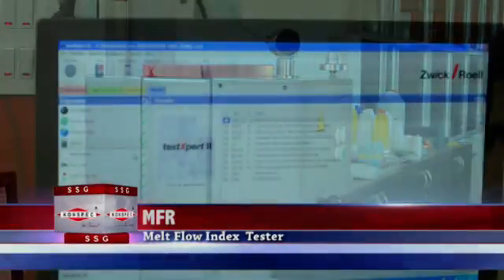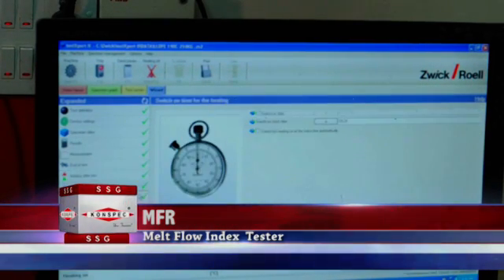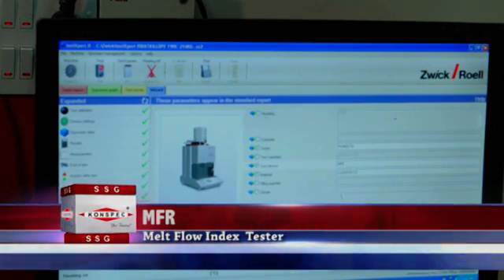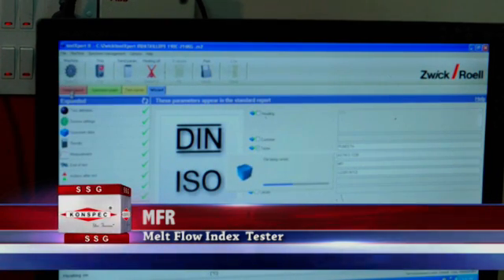Melt flow index tester as per ASTM D1238 to measure the flow rates of thermoplastics by extrusion plastometer. This test indicates the uniformity of the flow rate of the polymer.